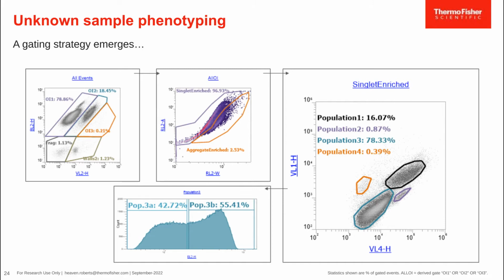Population 3, I couldn't fully separate. I keep saying I'll come back to this and maybe someday I will, but I would like to stain these samples and run them again and try some different staining and separation protocols to better separate population 3.